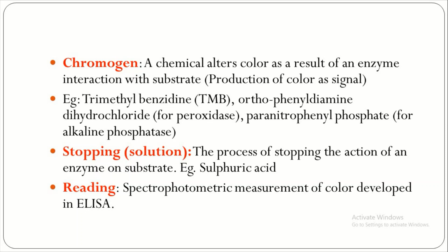Next is the stopping solution. After the reaction, you have to stop it. This process halts the enzyme-substrate reaction. Many people commonly use sulfuric acid. After you stop the reaction, to quantify the colored product, you have to read it in the spectrophotometer.